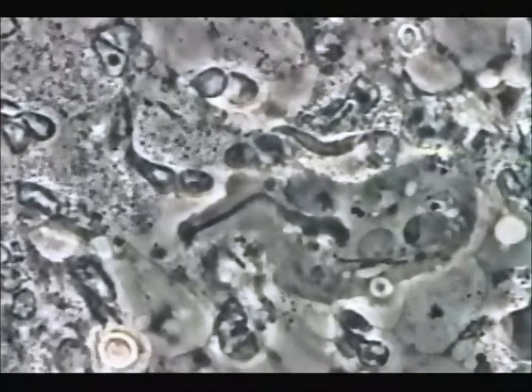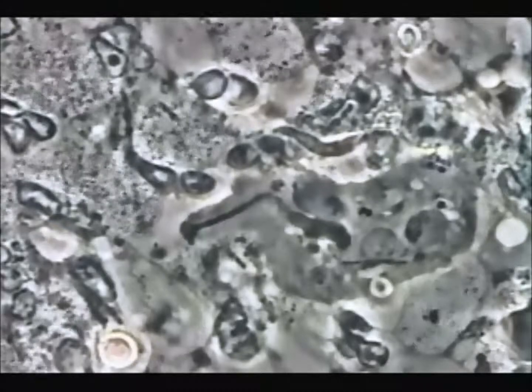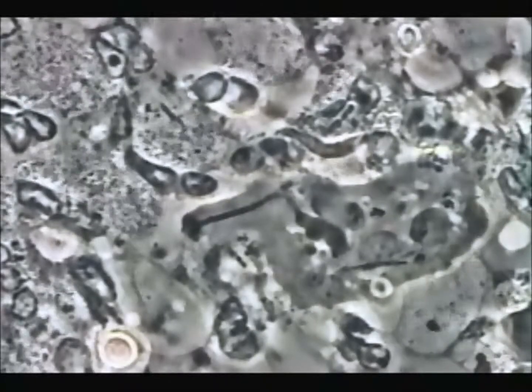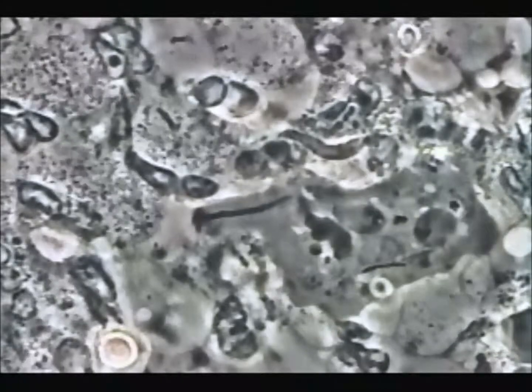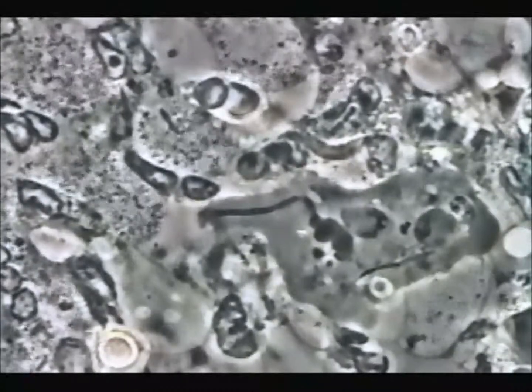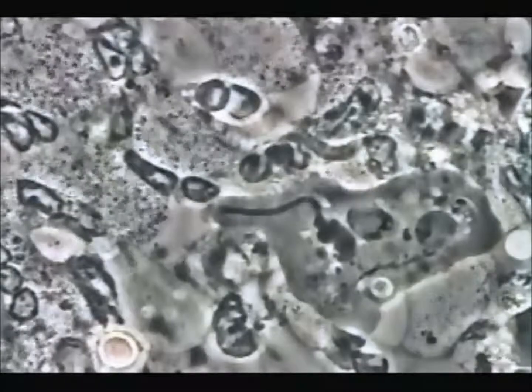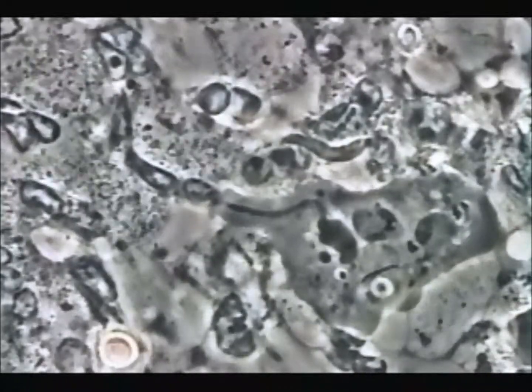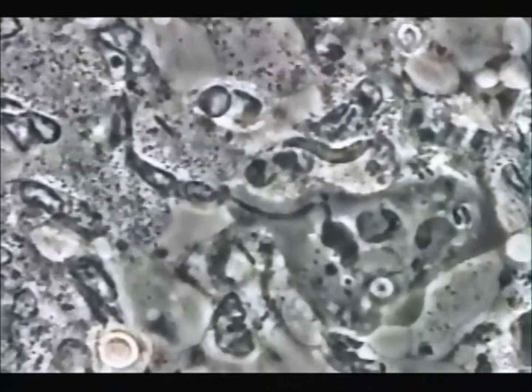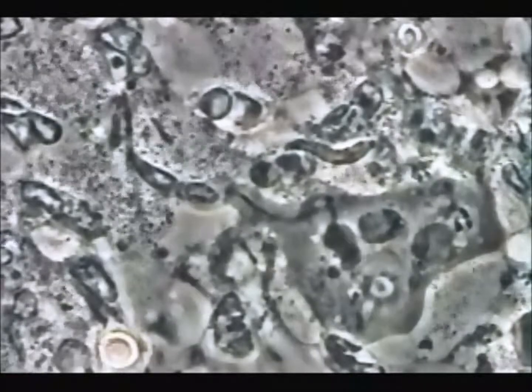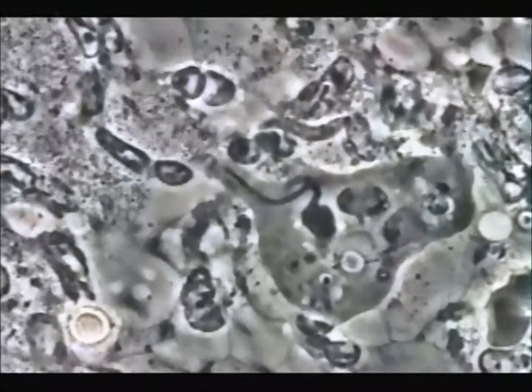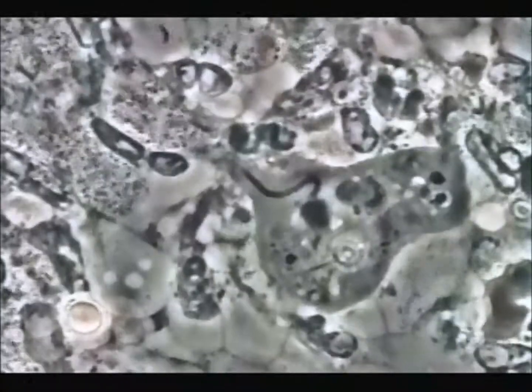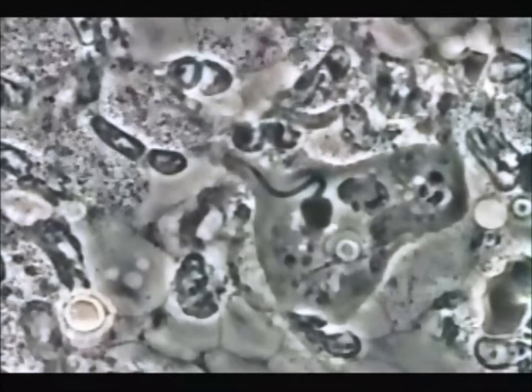You see progressively the nucleus getting into the amoeba, and once it is inside the amoeba, it reorganizes in a circle position, in a circle form which will be at the end phagocytosed and digested from the amoeba.